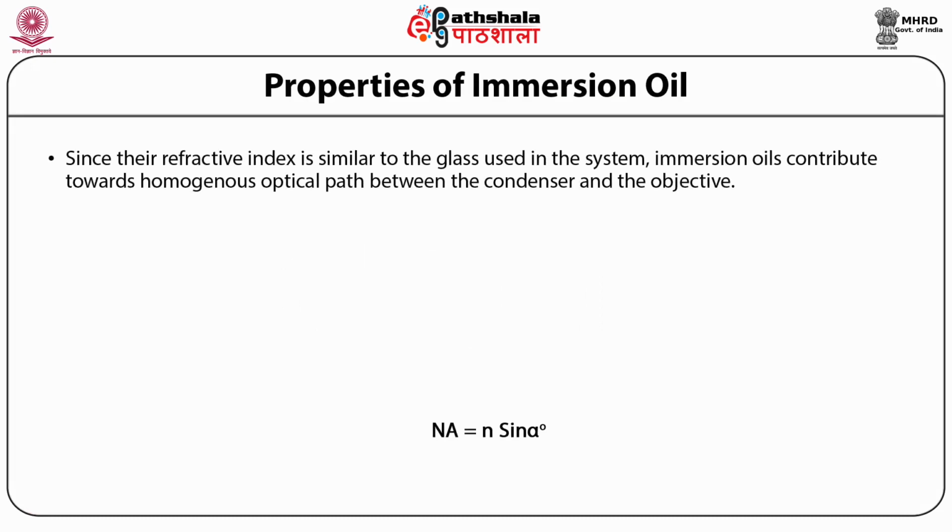Since the refractive index is similar to the glass used in the system, immersion oils contribute towards a homogeneous optical path between the condenser and the objective.